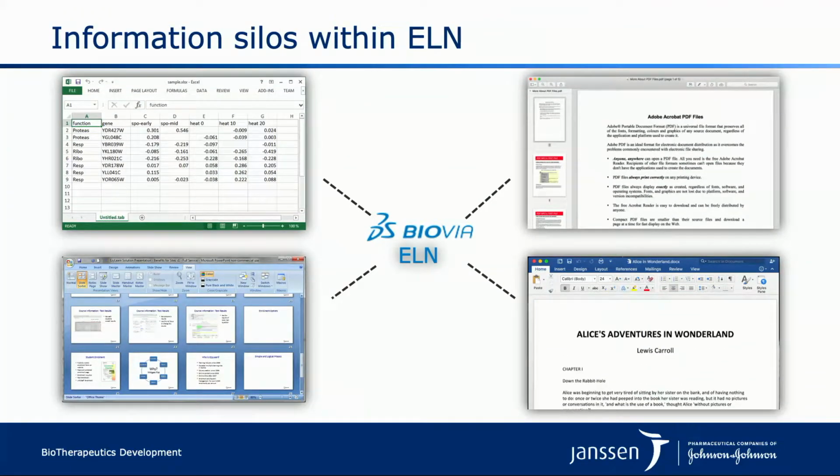So where is the information sitting now? We have an electronic laboratory notebook, but in those notebooks, we generally save the data in different formats, as you can imagine. Some assay data or sample submissions are in Excel sheets, and some of the results are summarized in PowerPoint slides, and some protocols or other documents are in Word and PDF.